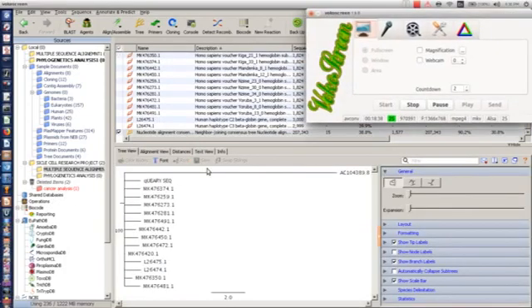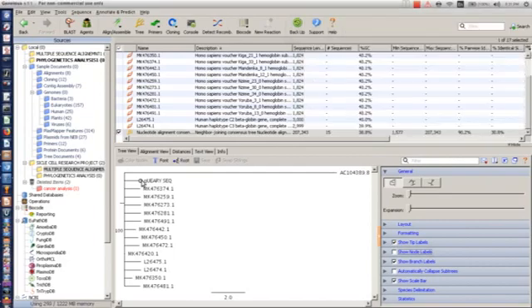So as you can see, these are the tree. So that's how we build our tree. This is the outgroup we initiated here. This is the outgroup, and all these are our query sequences. As you can see, this is our query sequence, and that means this is trying to tell us that the whole of these are 100% identical.